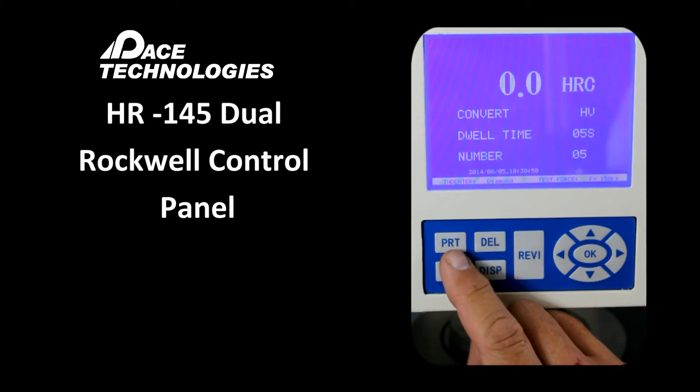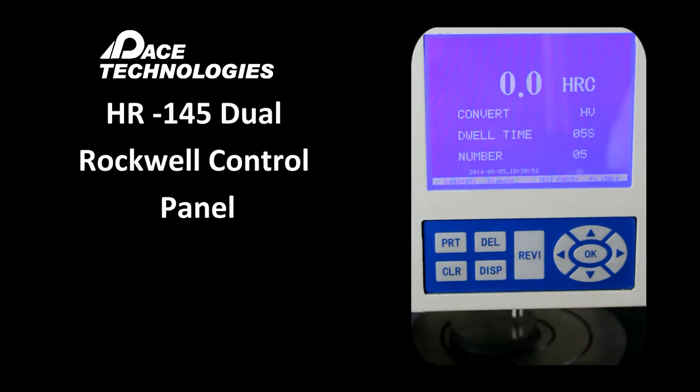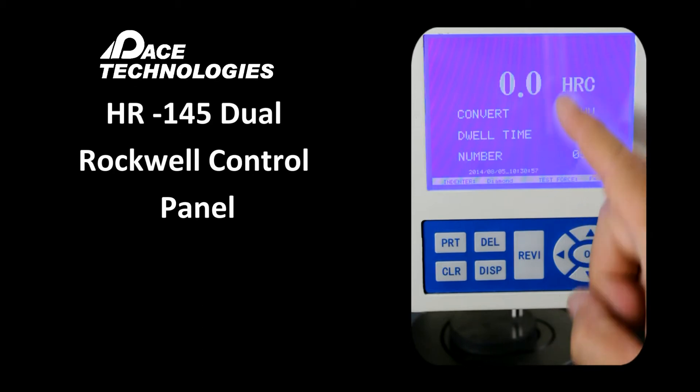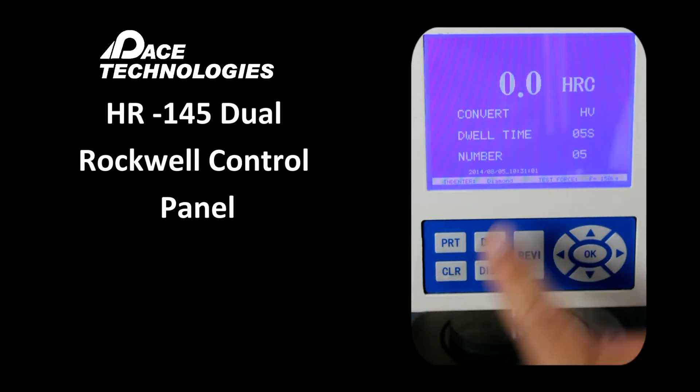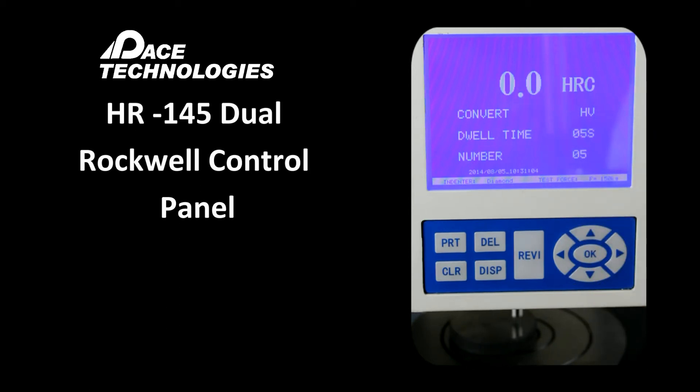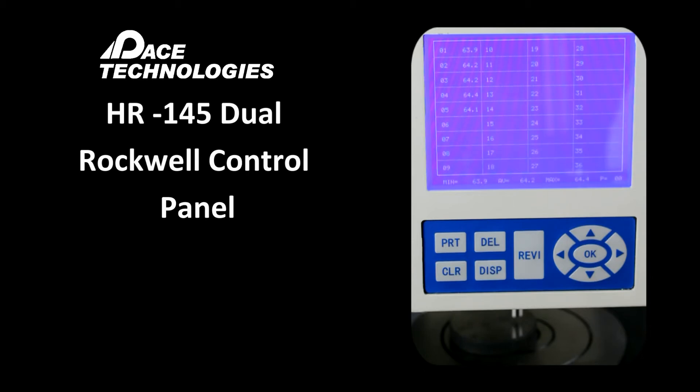PRT is the print function — after making measurements, we can print them out. Clear is used if the unit is not reading zero with no load applied to the indenter; press it to re-zero. Delete allows removal of the previous hardness measurement if something was wrong with it. DISP or display shows past measurements — up to this point, we've made five measurements.